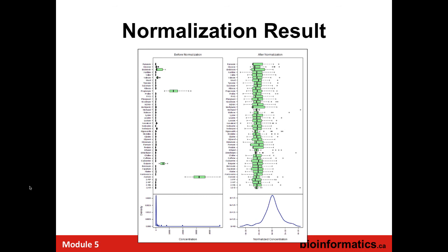And actually, I asked the statistician about it because I started using Fox on R to see what is the right way. He said, no. Biologically, you cannot. You have to find the justification to normalize this one with log and the other one with square roots or whatever. There is a reason why not to do it when you have multivariate.